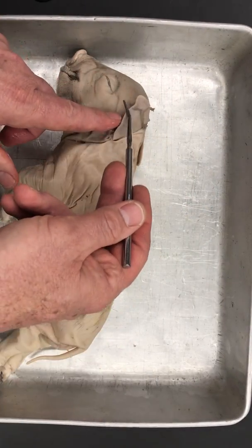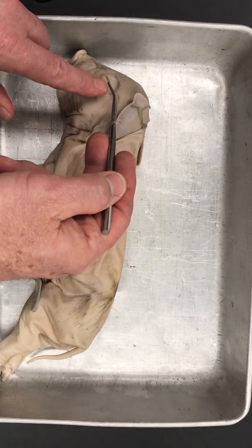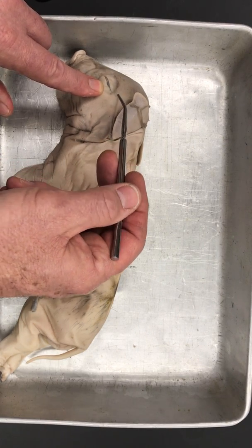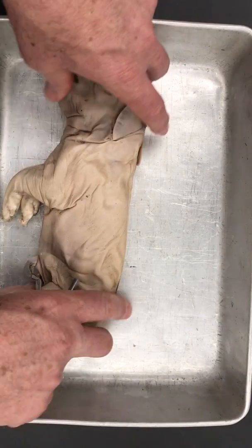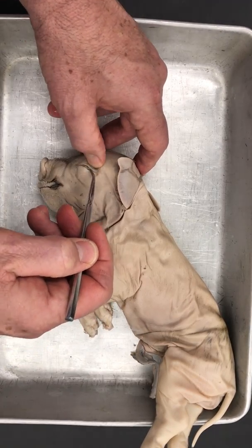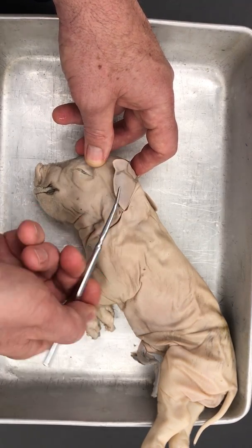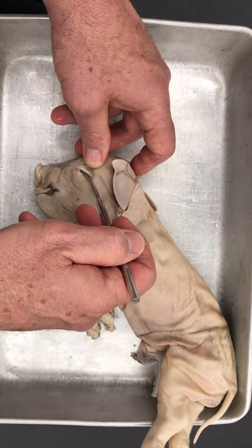So what's this? This is called the ear. It's also known as the pinnae. Here's the eye for the pig. Now, one of the things you're going to look for is the nictitating membrane, and that's right inside the eye. So if we open up the eye a little bit, let's get this guy in the middle so you can see that pretty clearly. So the nictitating membrane, if I open up this eye, there's a little membrane right there. You see that? So I took my blunt probe and I went underneath it. I'm not gouging his eye out, but that's what I'm doing.